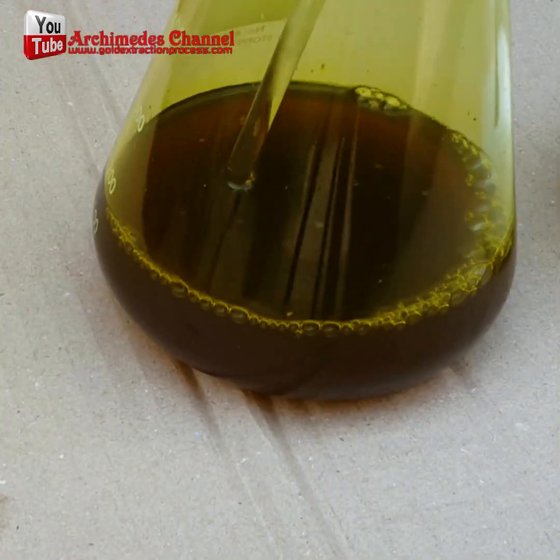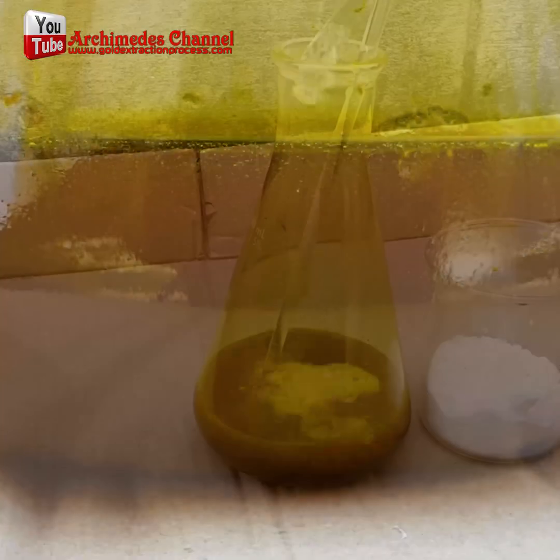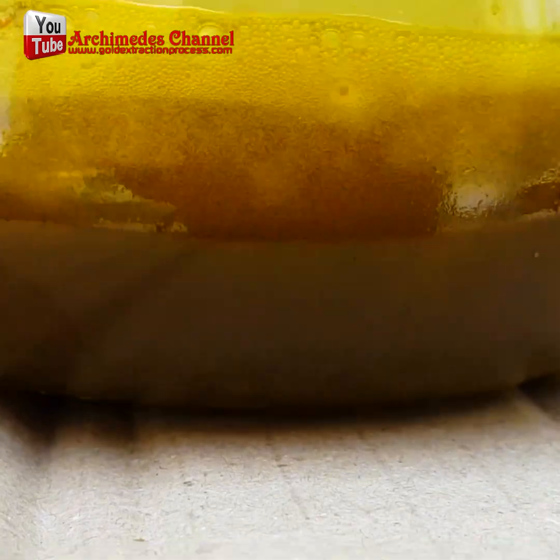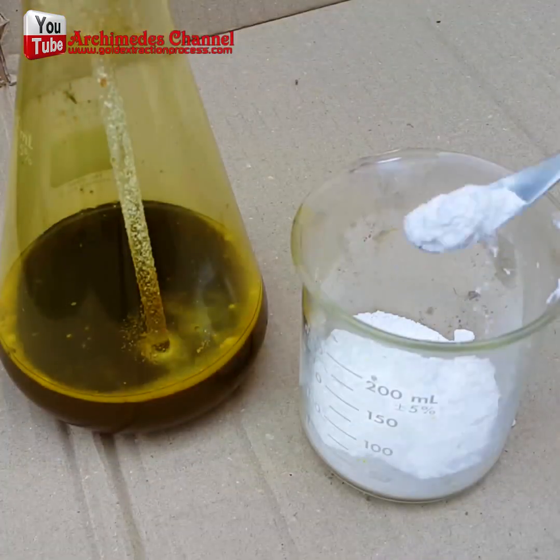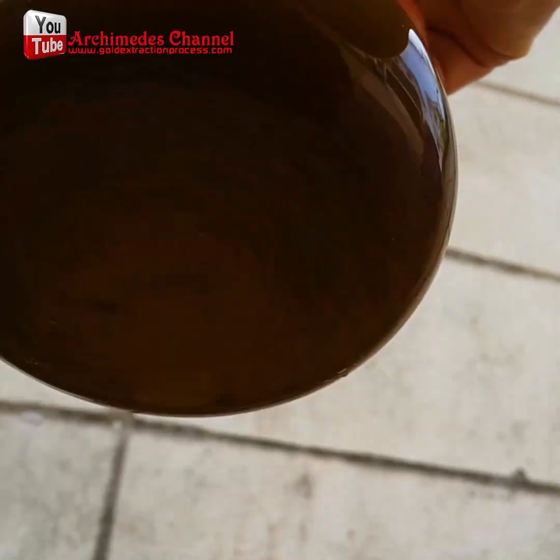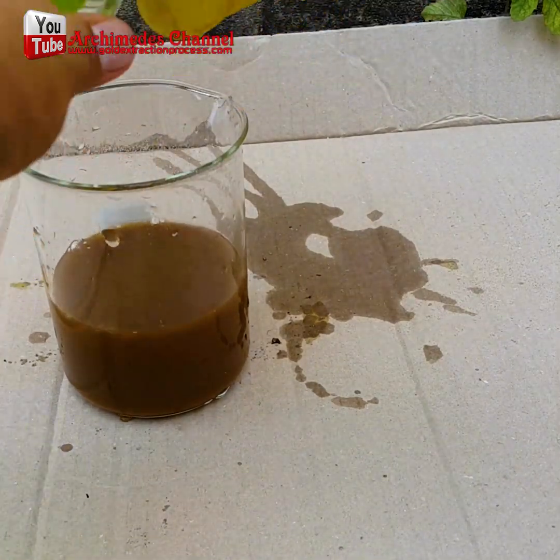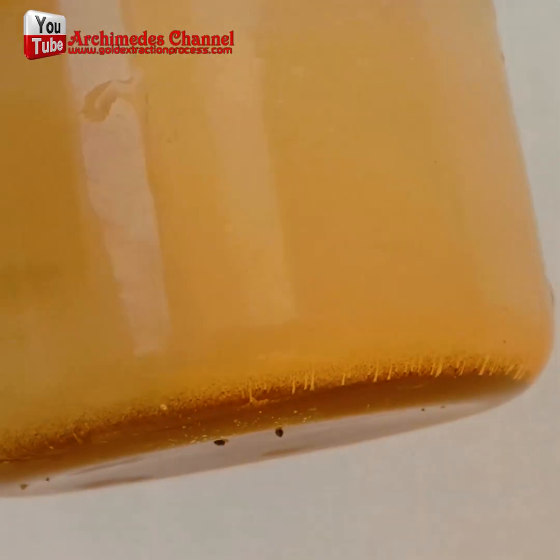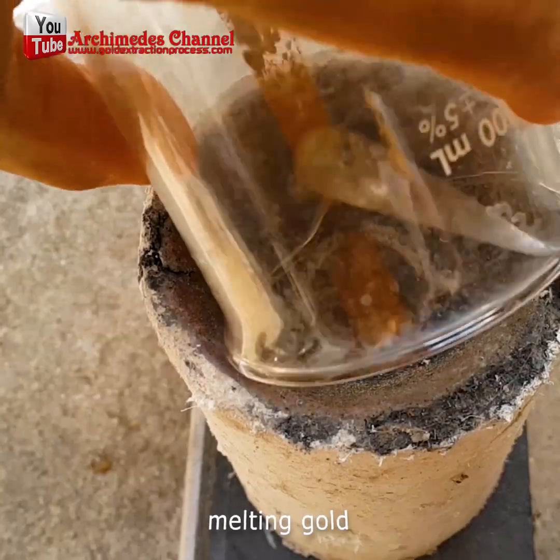A little at a time is added until the reaction starts. A little stirring until it's all dissolved — and just check the bubbling out now. You can see it fizzing. Watch what happens — there's a clear separation. Suddenly it becomes clear. That's gold, sitting down at the bottom of the container, rinsed out a few times to ensure none of it's been missed. And there's the good stuff down at the bottom of that beaker.